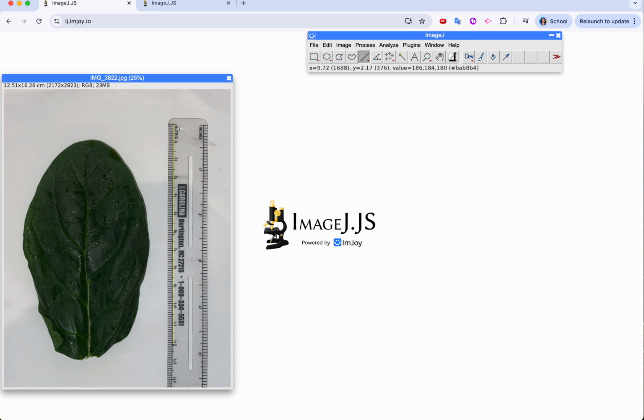And you can see that if you now draw another line in your image, and I've actually had students use this for a lot of different things, it will tell you the length as you're drawing. You can see up here, as I was selecting that, it was telling me the length of the line.